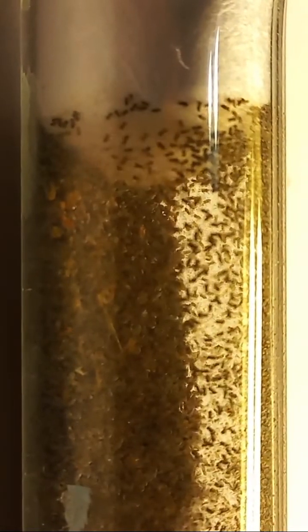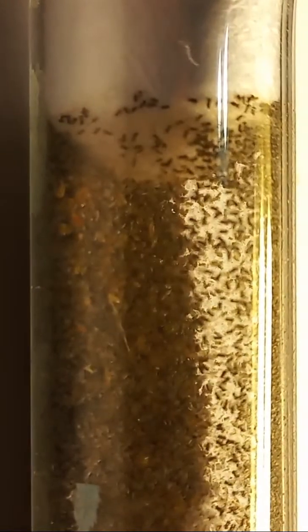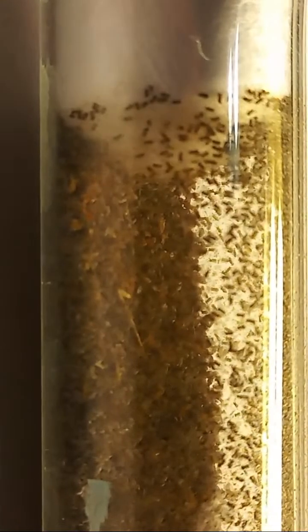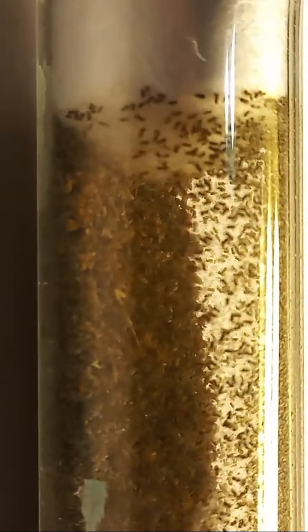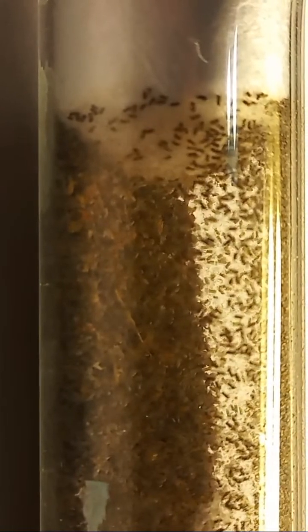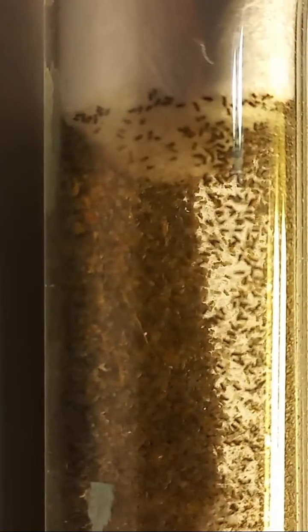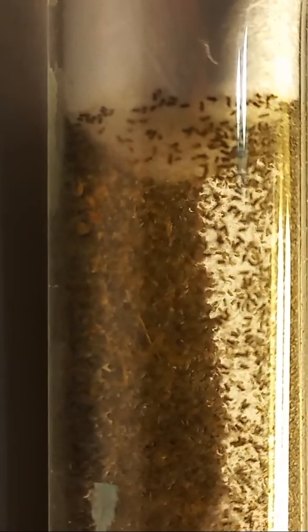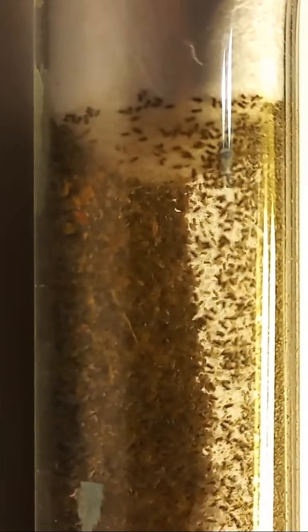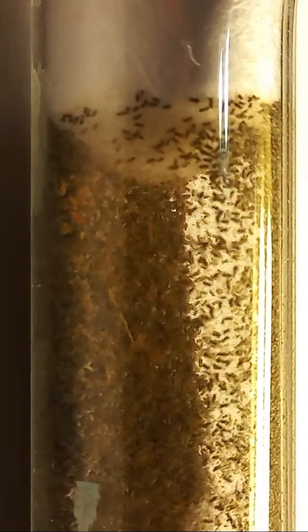So in this case, it's possible to know the host egg place and host name more precisely, and to breed them in certain numbers in the laboratory to receive females and males. Most important is to receive males. With females, it's possible to multiply the culture, to have more individuals, and with males, it's possible to study them, to identify them after making microscopic slides.